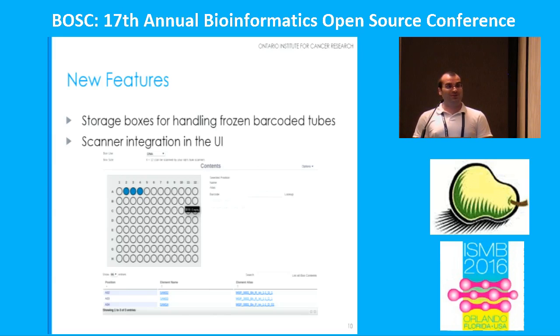Turns out you can talk to the scanner programmatically. So one of the features of MISO boxes is you drop the thing on the scanner, you hit the scan button in MISO, and it says, here are all the tubes I could find that weren't completely covered in frost.